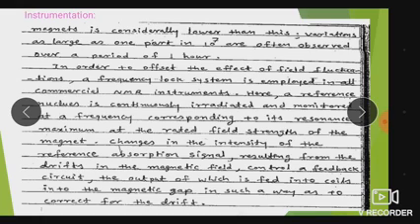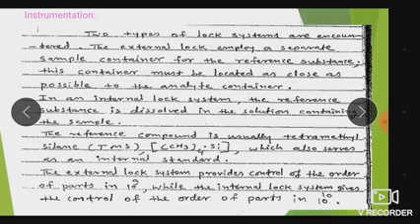in such a way as to correct for the drift. So what is the fluctuation? The fluctuation is removed by using the reference sample, irradiating it with a constant field, and this drift is fed to the coil, so the fluctuation in the magnetic field is maintained by means of using references. So two types of frequency lock systems are encountered.